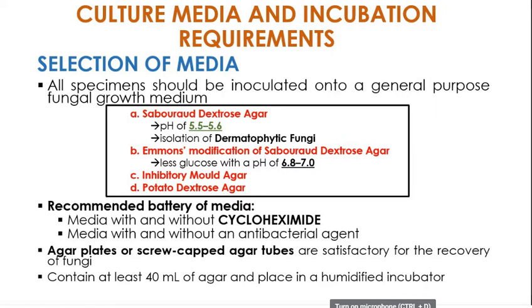Okay? Now, bakit 40 ml ng agar? Ilan yung ml natin sa bakte noon? Ideal volume ng ating bakte.